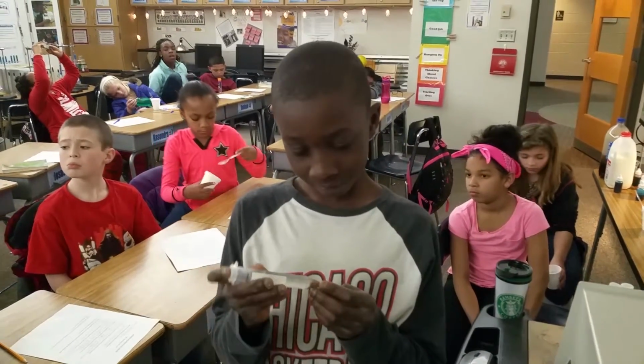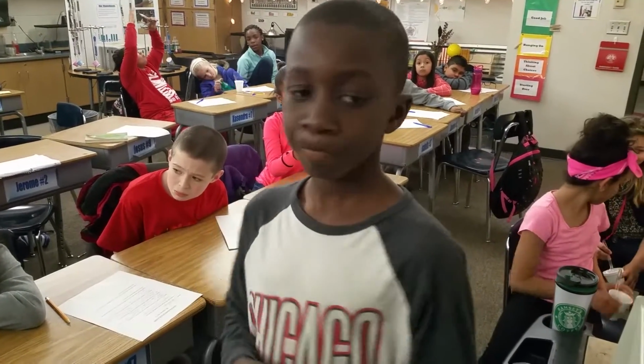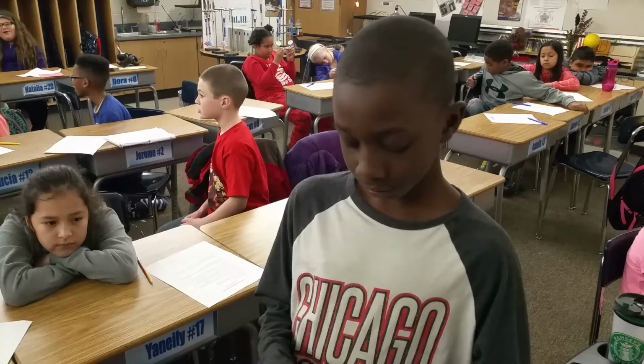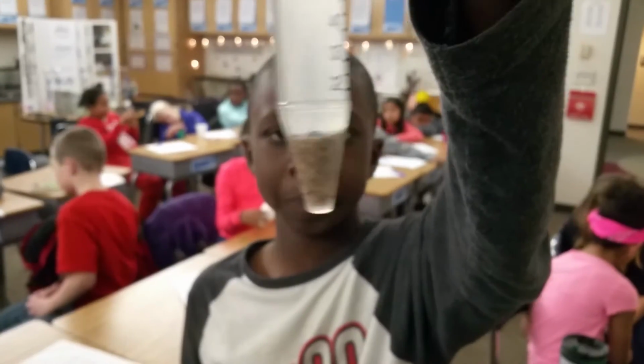And if you go home and follow some of the news stories about the water in Flint, Michigan, if they centrifuge the water in Flint, Michigan, you would not believe what they're seeing at the bottom of their test tube. The water is literally not safe to drink. And so this is a good way to test how pure your water is, by putting it in a centrifuge. Now let's look at how much sand you've got in there. Could you imagine if that was in your drinking water? That would be dangerous.